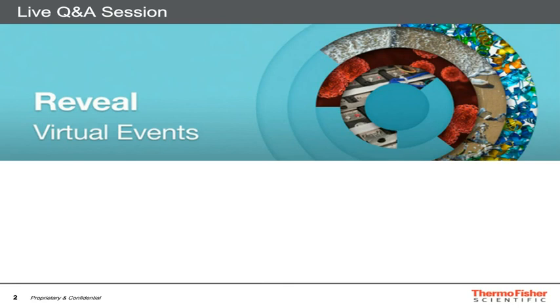Right. And I think the last question, because our session is almost over, Paul, this question is for you. The question is how to mitigate the effect of charging in UPS for non-conductive samples. UPS is a cousin technique of XPS. Instead of using X-rays, we use ultraviolet photons at around 21 eV compared to the 1,500 eV for XPS.